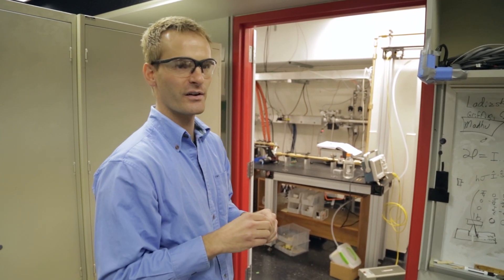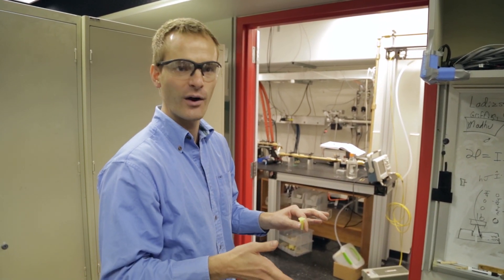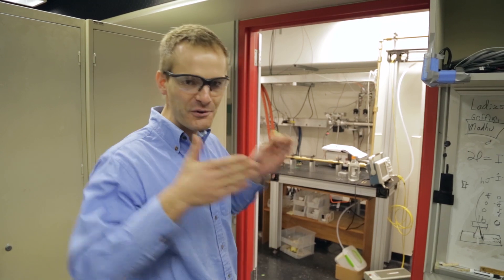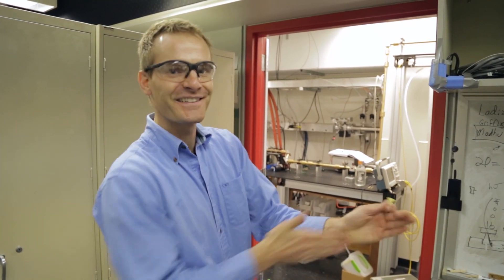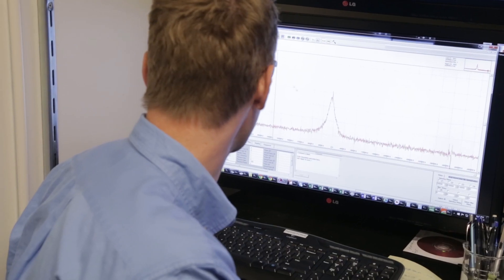All the students in the lab have been building all the equipment for about two and a half or three years now and it's going to be the first time that we really put everything together so we're really excited to get going. Okay I think we're ready here.